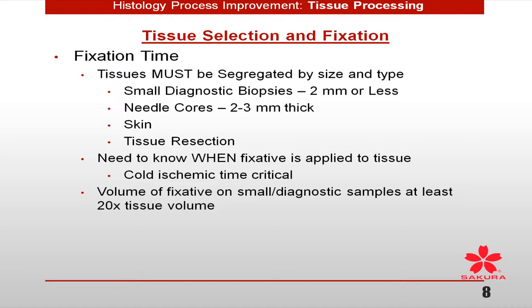And it's very hard to combine those all. Again, if you're trying to combine them all onto one processor, one process, you're not going to see optimal results. You're going to see a bigger variation and acceptable results, but in today's lab, is that really going to get us where we want to go, that we've got acceptable instead of optimal?